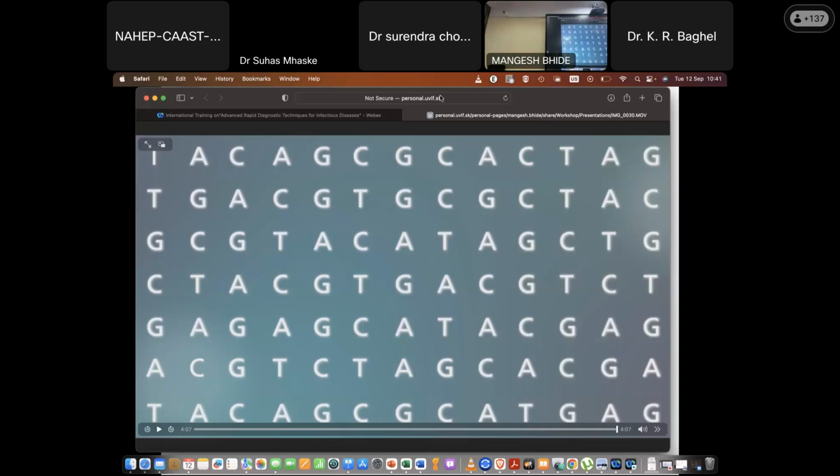The company said that when you are sending the sample, you should include which primer you have used. So whether we can do that primer with another primer.